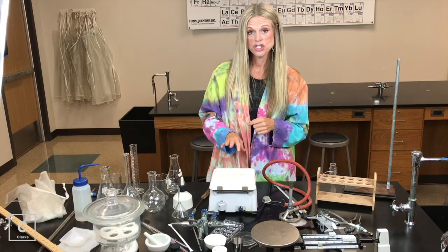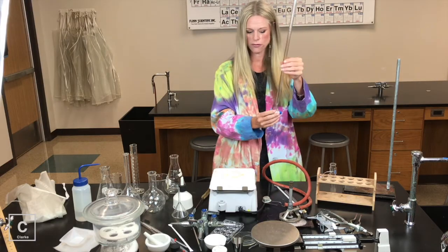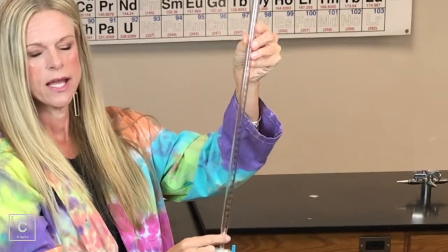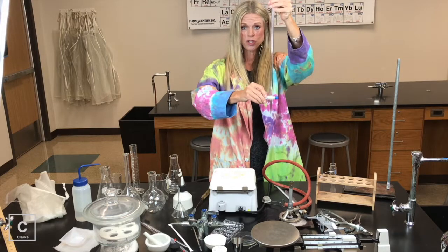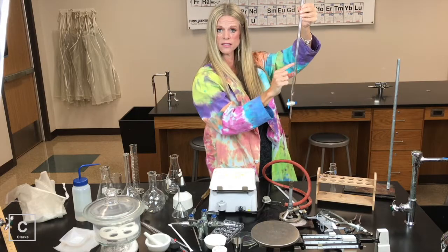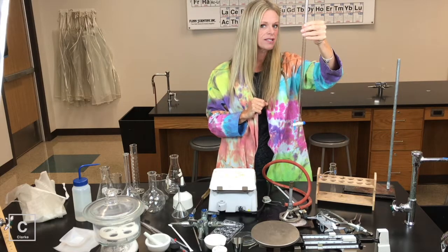Before we leave the glassware, let me show you a buret — also something probably pretty new to you. You may have never used a buret before. It kind of looks like a graduated cylinder and has a lot of measure lines. A buret is going to be used to dispense accurate and precise amounts of liquids. You turn on the nozzle, dispense some liquid, turn it off, and since you've got all of these measure lines, you can see precisely how much liquid or solution you dispensed. A buret — used for measuring when we're dispensing liquids.